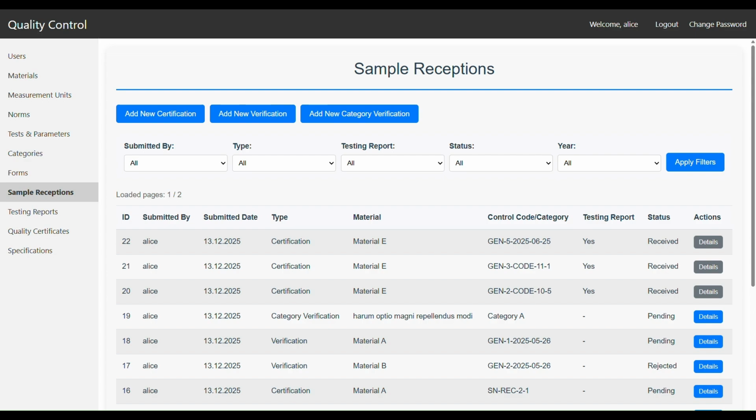These samples are usually materials produced by the organization or raw materials used by the organization in production. The certification samples are collected according to internal procedure of the organization, and the laboratory must be qualified to perform the testing methods mentioned in the associated specification. The test must be performed according to existing standards, making sure that the results are within the accepted margin of error.